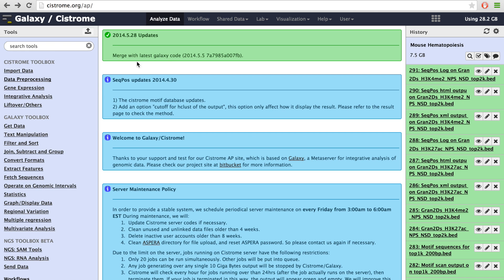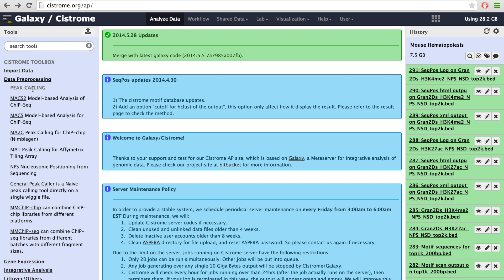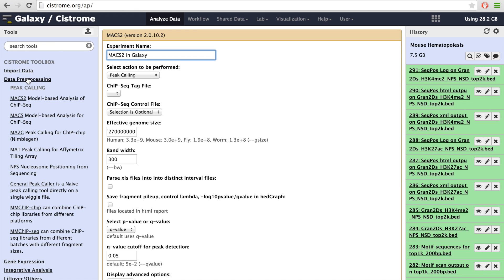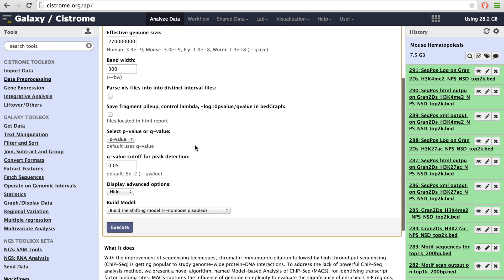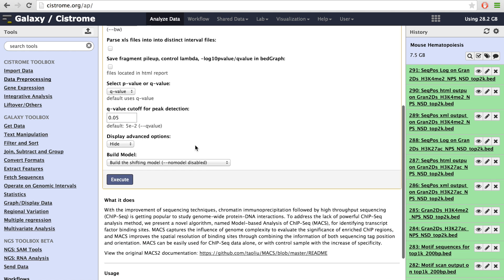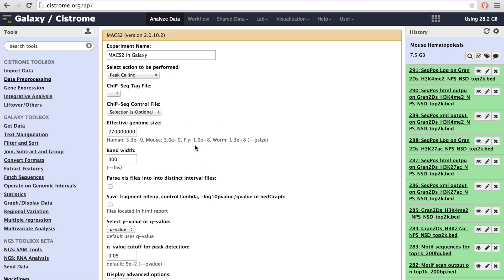The center panel is the main analysis panel. Taking the MACS tool as an example — if we click the MACS tool, the interface has all the places where you can input files and set up all the parameters. When the analysis is done, the center panel is also used to show the results.